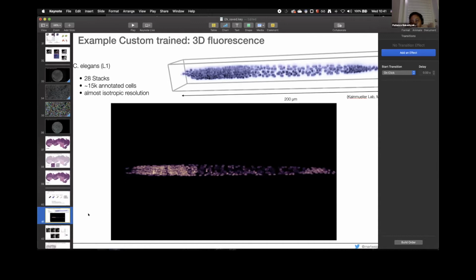Yeah, it could fluctuate a little bit because the actual points that are chosen are different, but perceptually it should not go down by a lot. It should wiggle a little bit, but this is just due to the different changes of points that you use to discretize. It should not drop 10% or so.